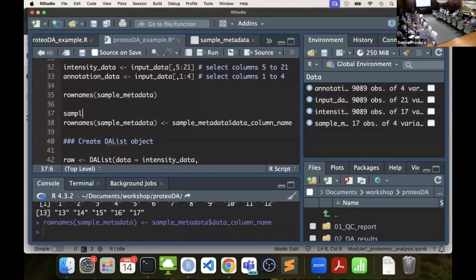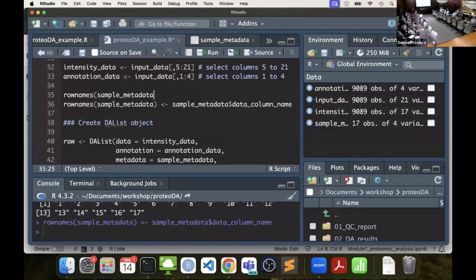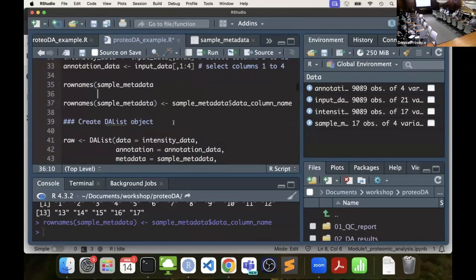I don't think I ever showed you that, Dennis. Oh, yeah, so another little R trick.